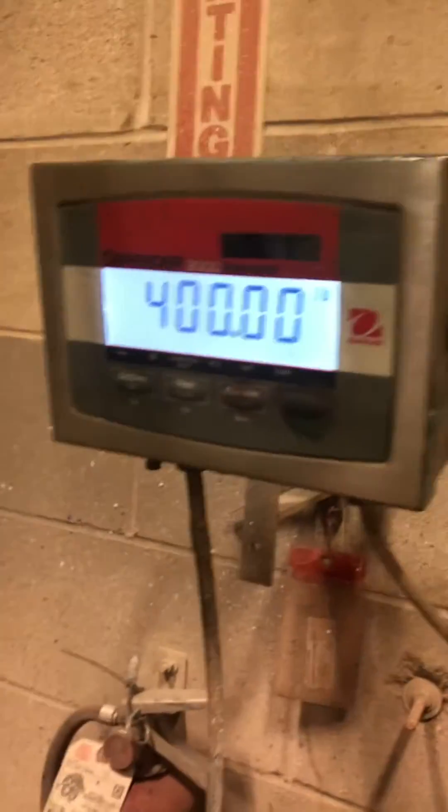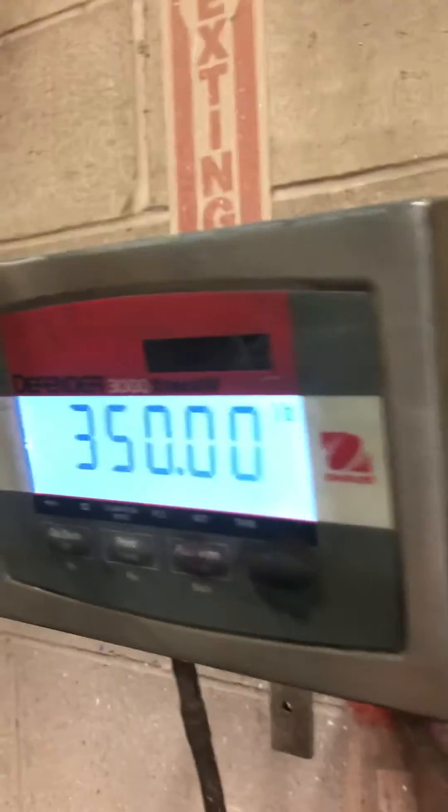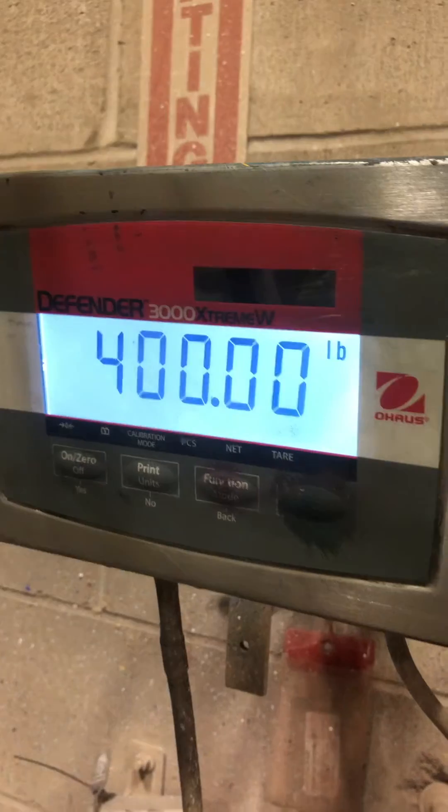At this point, you do nothing else. Just make sure that the weight repeats when you remove the weight. For a hundred. Thank you very much.